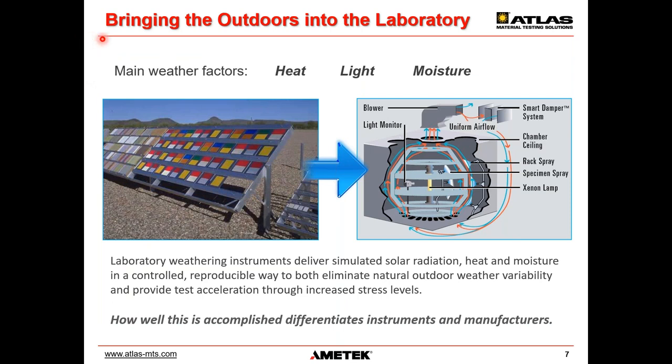The intention of any laboratory accelerated weathering instrument is really to deliver the same factors of weathering to which materials are exposed in outdoor conditions or in indoor conditions. That means the goal is really to bring those stress conditions from outdoors into your laboratory equipment as well as possible. As you may have learned from a previous presentation, this means we're bringing inside heat, light, meaning radiation, and moisture. And regarding the moisture, this can be either through humidity, water spray, or water condensation methods.